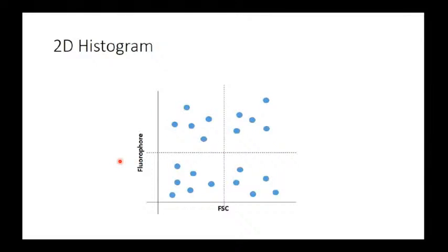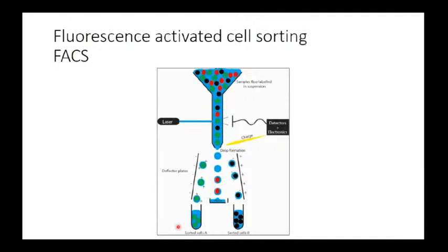Now, what's special about the FACS mechanism, and why is it called FACS? FACS means fluorescence activated cell sorting, which means this mechanism cannot only give me data about the cell count or the percentage of cells expressing the protein and not expressing the protein, but FACS can also separate the cell mixture into two groups of cells. How does it work? Let's see. This is the FACS mechanism.